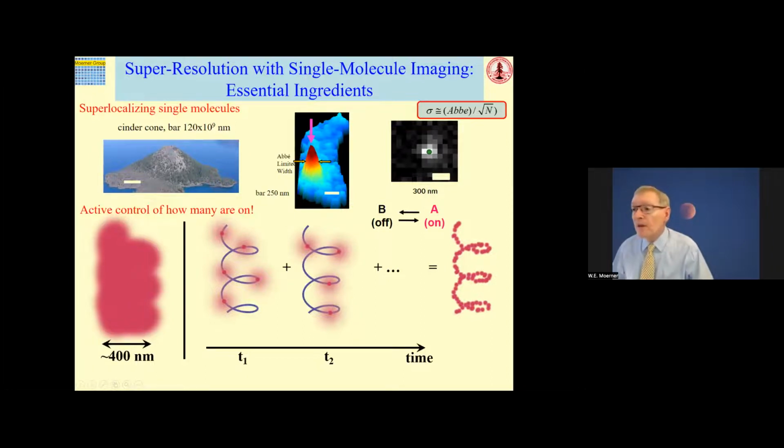By using the data that's in the computer to reconstruct the positions into one, we call it a reconstruction. And you can clearly see that there's super resolution detail beyond the diffraction limit. And that's basically how this works. This is super resolution microscopy or nanoscopy. So that's the key idea. That's how it works with single molecules.